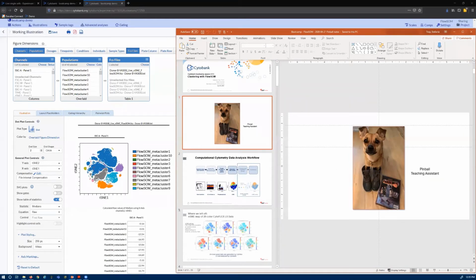Okay, so without further ado, the very first question. How do you utilize FMOs in the dimensionality reduction clustering algorithms, which is actually a really important question. So would you import the FMOs into your actual analysis, or would you use them to do your cleanup of data? And I'm going to refer this question to Jihao.